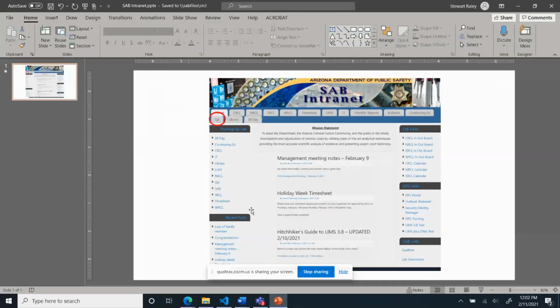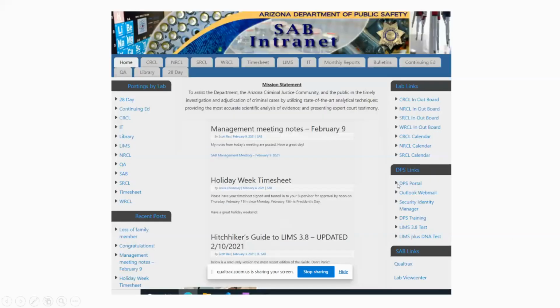I'm going to start this presentation just because it'll give you a better idea of what we're looking at in the lab. The Arizona Department of Public Safety Crime Lab has 4 labs throughout the state of Arizona, and this is our homepage for the lab system. We have just general lab stuff, the in-out board where we clock in and clock out, and some meeting notes. Next week's a holiday, so the timesheets need to get in earlier. We're updating to LIMS 3.8, and so we've got a user's guide for that.